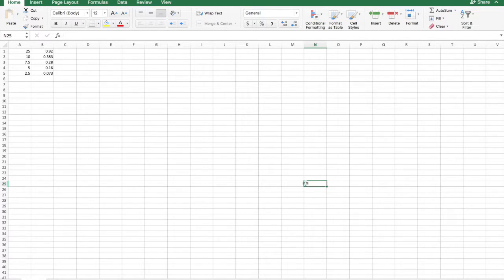Right, so I'm going to walk you through all of the graphing that you need to do for this lab. Ultimately, the purpose of this entire lab is for you to determine the order for the reaction of crystal violet with hydroxide. So looking at how the concentration of crystal violet changes over time, creating your three different graphs to determine if it's zero order, first order, or second order.